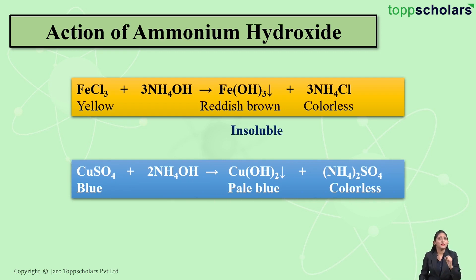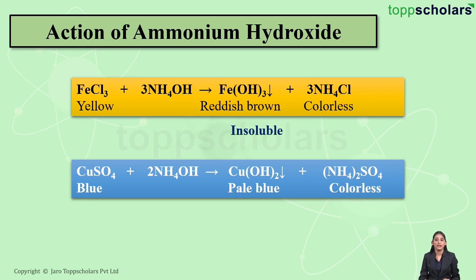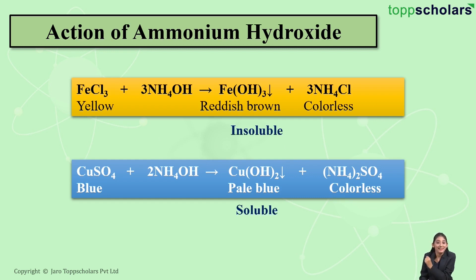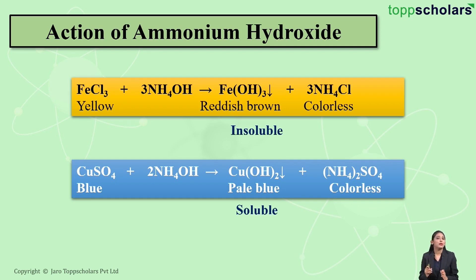Let us move on to copper sulfate, which is blue in color. If I add drops of ammonium hydroxide into this solution, it results in the precipitation of copper hydroxide — a pale blue precipitate — along with ammonium sulfate which is colorless. This precipitate of copper hydroxide is soluble in excess ammonium hydroxide; it dissolves when excess is added. So if you get a pale blue precipitate that is soluble in excess ammonium hydroxide, the metal ion present is Cu²⁺.